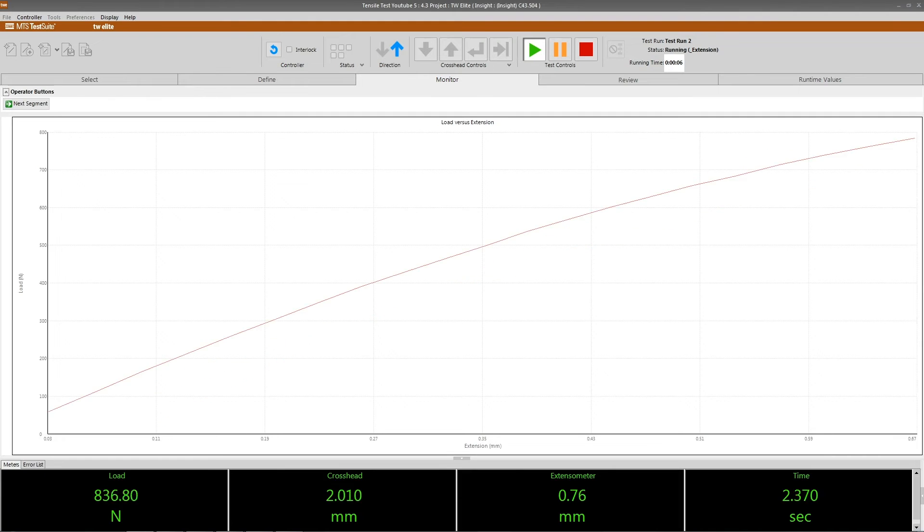This test will begin once we click the green play button. The crosshead will begin to move and data collection will begin.